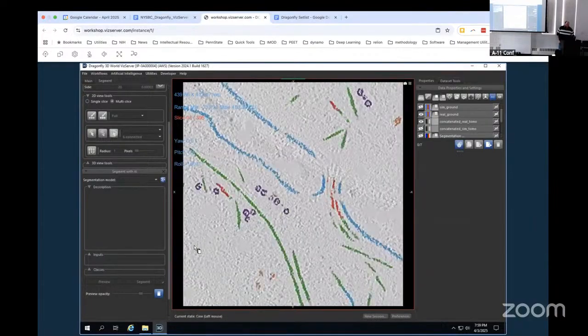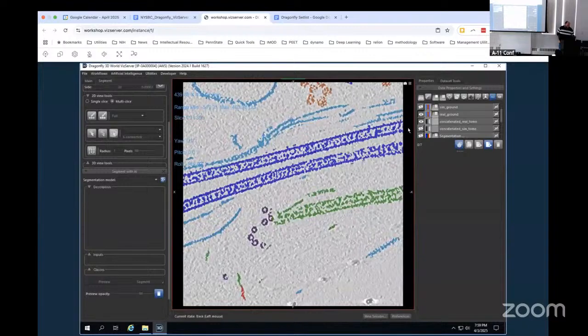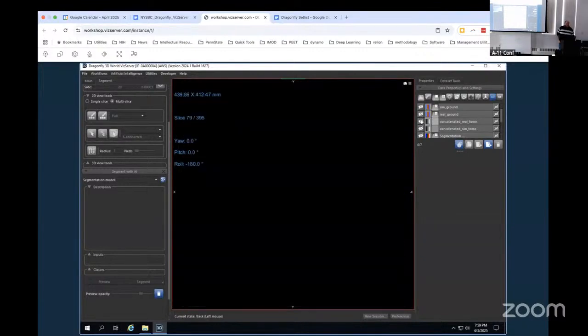And anyways, so it's more training, right? More training. This one would take a while to train, right? Like overnight to do a really good job. Maybe only 6 hours, but it still takes time.